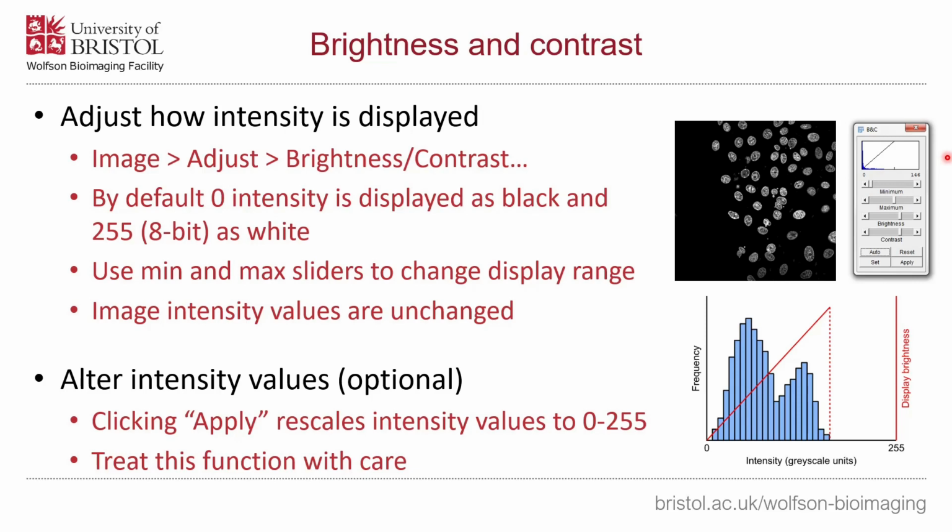If you should want to stretch those values so that the values stored within the image itself go to the full range of 0 to 255, you can do it by clicking apply. But as I say, you really want to treat that function with care, because then you're actually modifying your image, and it might make comparison with other images difficult or invalid.